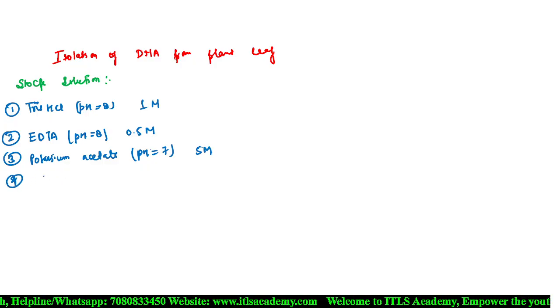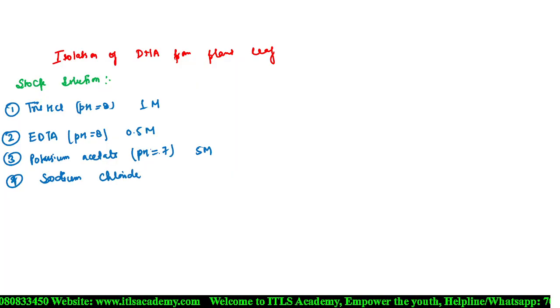Fourth is sodium chloride, whose concentration is 5 molar. In sodium chloride, you don't need to maintain its pH.